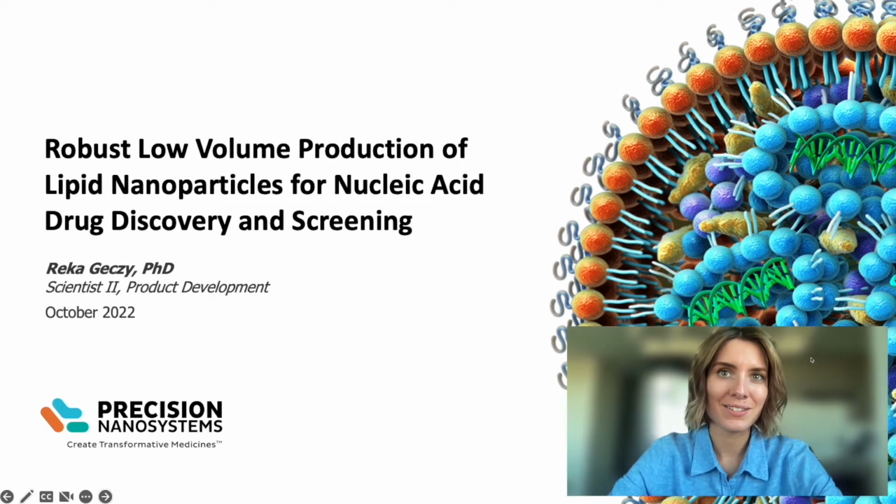Today, I will present to you a novel technology for the robust, low-volume production of lipid nanoparticles for nucleic acid drug discovery and screening.